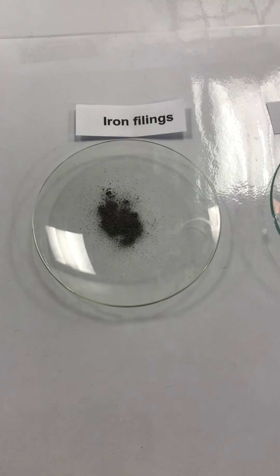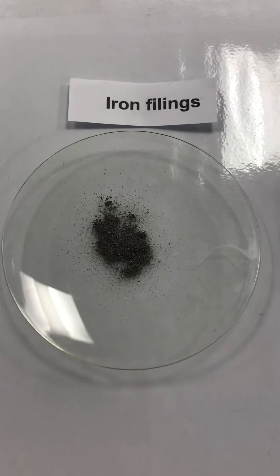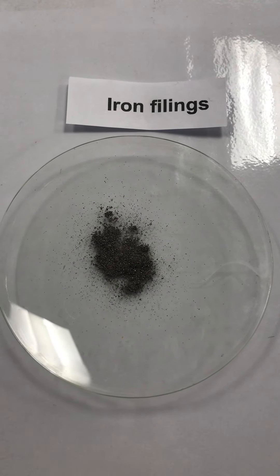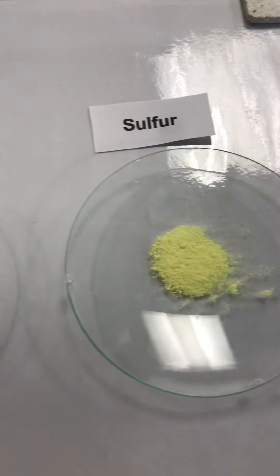We have divided this experiment into four parts. Let's start the experiment. Part one: let's check the appearance of the elements. Iron filings are dark gray crystals, whereas sulfur is a bright yellow powder.